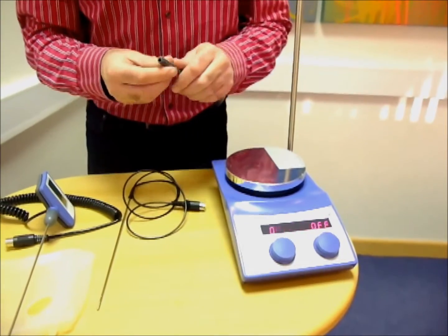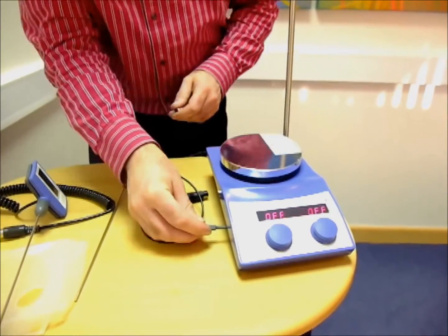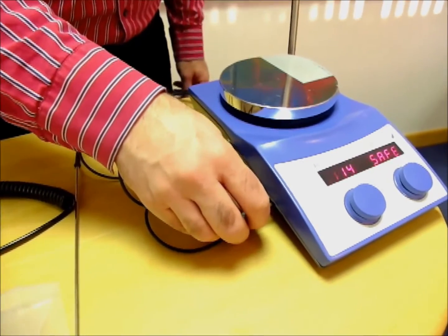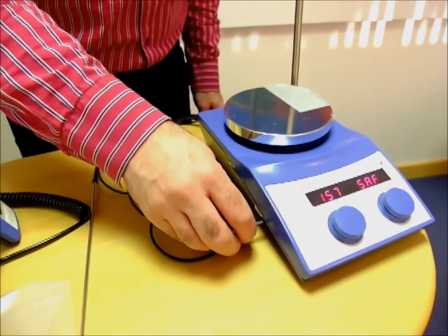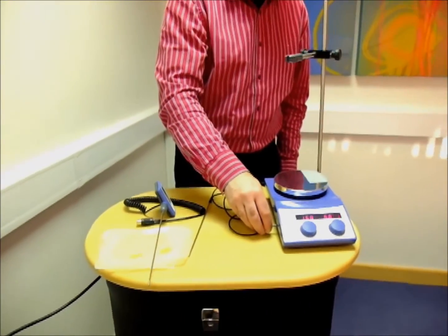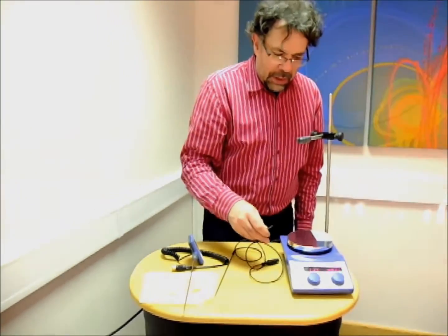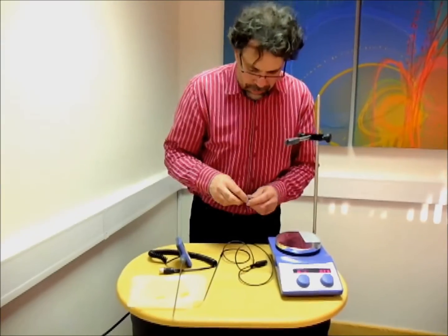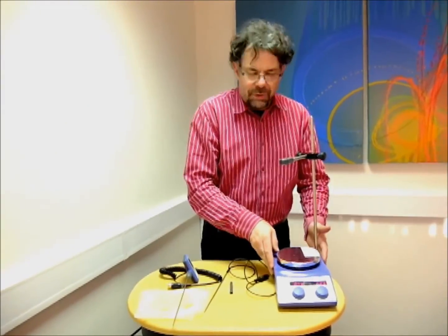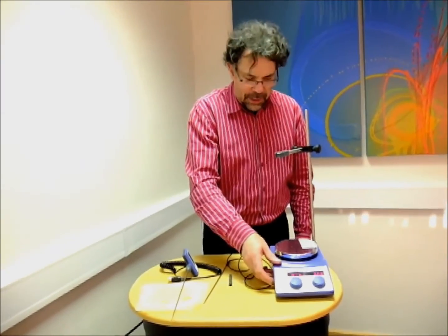In addition to that, within the hot plate itself we have a totally separate independent limit control. This allows the user to set a limit temperature. It can be very useful to ensure in teaching laboratories that temperatures aren't set above the boiling points of solvents, because the control knob cannot then be set above that temperature.